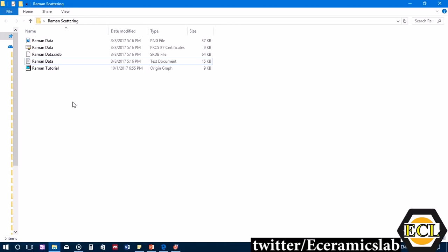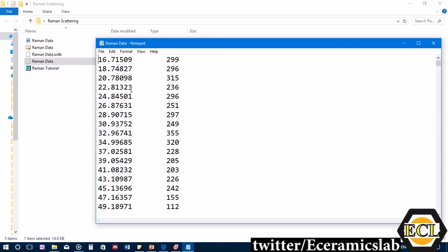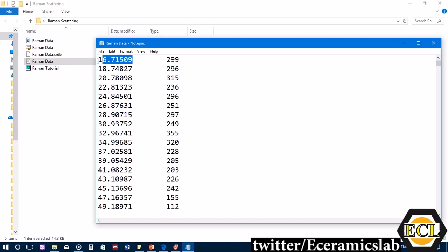You also need a computer with Windows 10. The data is in text format with two columns: X and Y. The X-axis represents Raman shift or wavenumber, with units of per centimeter in our case, and the Y-axis is arbitrary intensity.